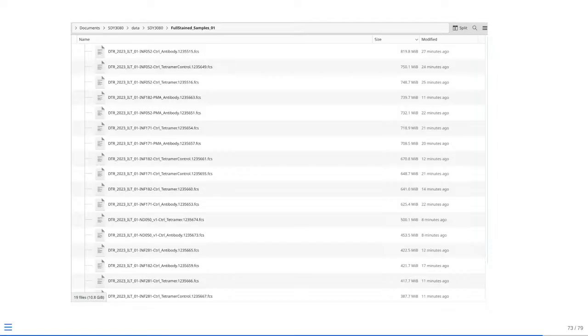also if you're trying to download somebody else's dataset that has been placed on a common repository, either ImmPort, Zenodo if you're more on the European Union side, or the repository that may come back to life in the next year, as the different people involved with the ISAC and Cyto community in general are trying to keep the repository up and running. But if every time you upload a new dataset you have to deal with this amount of data, it's a bit of a challenge across the board.